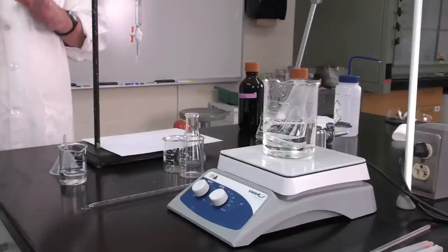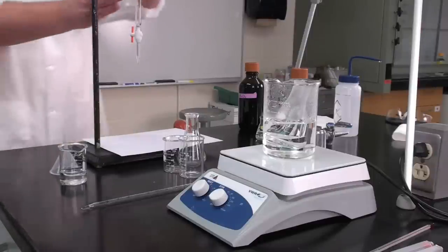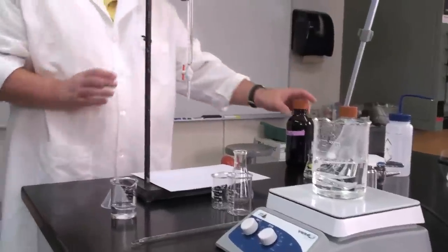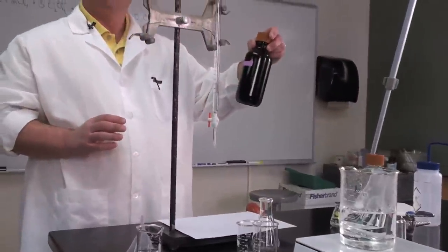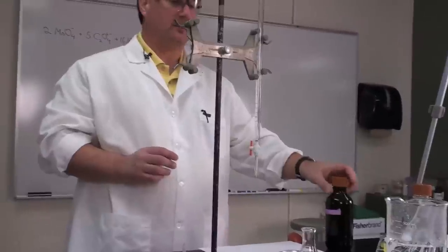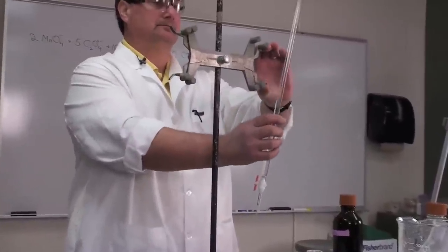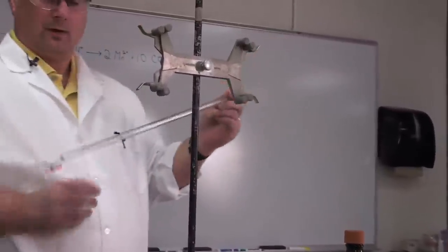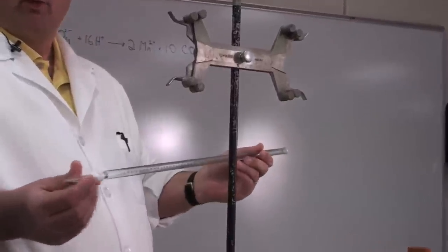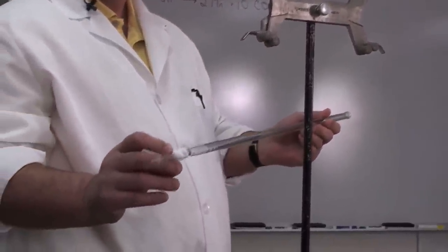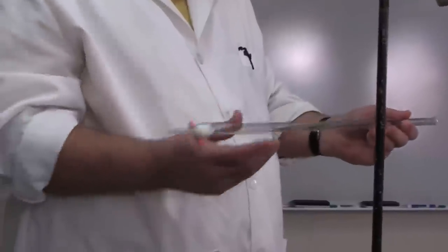While that's going, I'm going to set up my burette. Remember, we're going to put the permanganate solution in the burette. When you use a burette, you want to make sure before you start that the stopcock is closed and everything down here is tight.